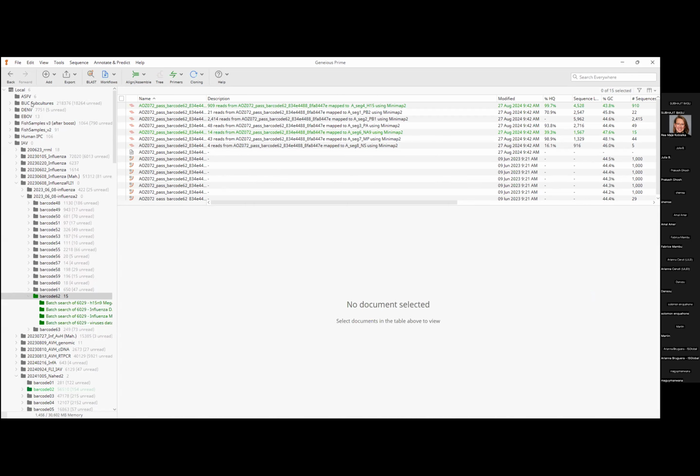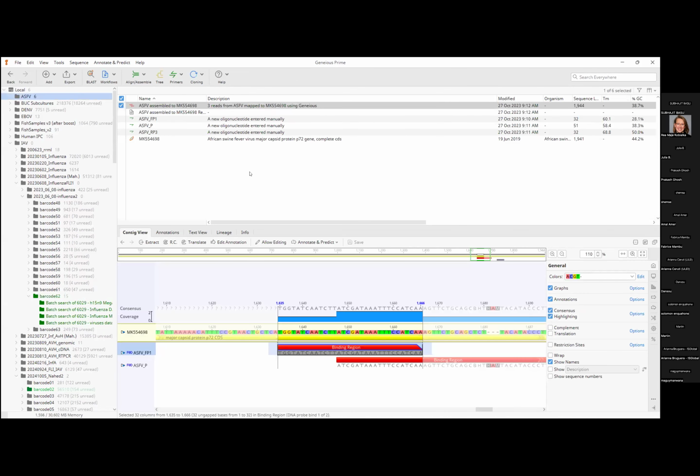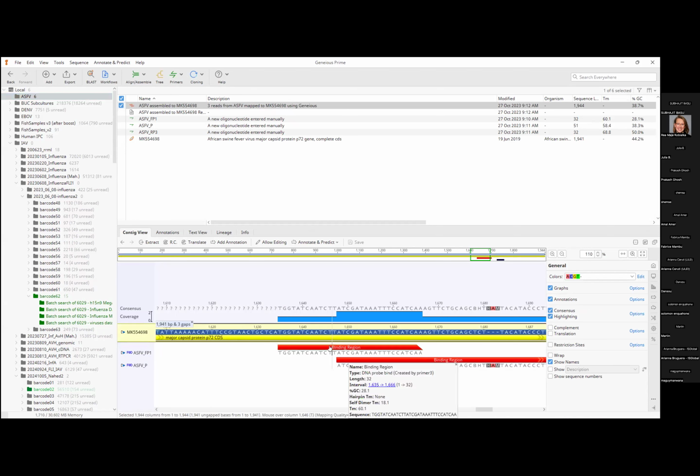And one of the more simple things I can use, also without having the subscription, the paid version, the trial version, you can do basic analysis like importing sequences from NCBI, and you can design primers, for example, for PCR or for isothermal amplifications.